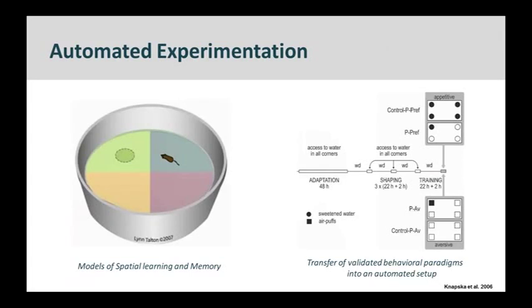Is it possible to transfer time and labor-consuming behavioral paradigms into the IntelliCage? I focus here on the Morris water maze, which is a standard paradigm to investigate spatial learning and memory in rodents, in which the animal has to learn the position of a submerged platform in a pool based on outside cues.